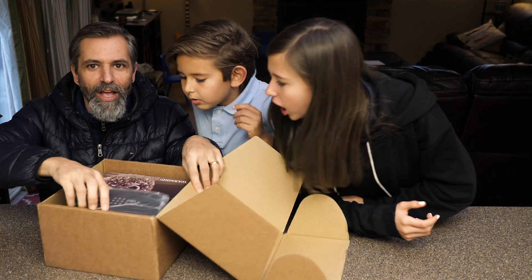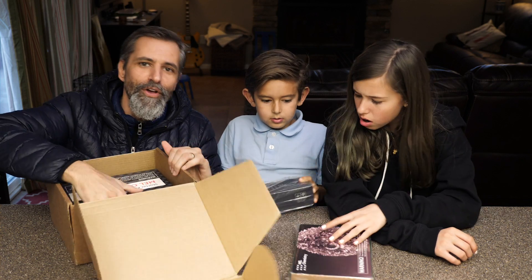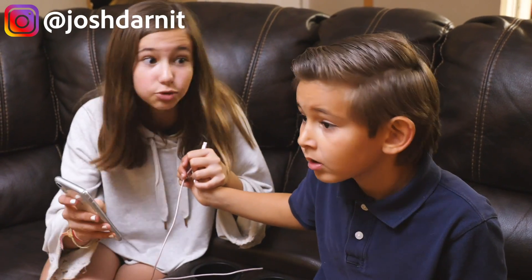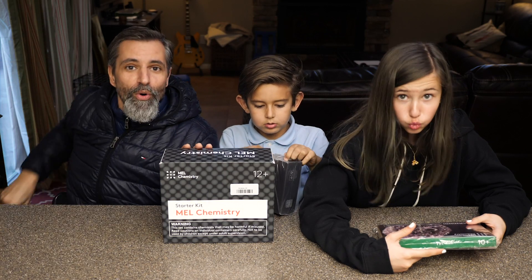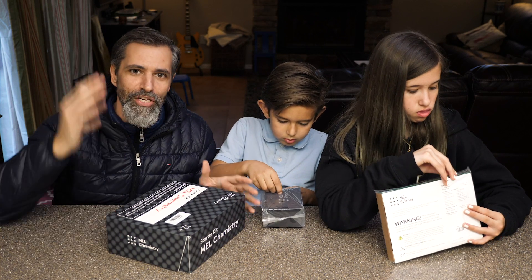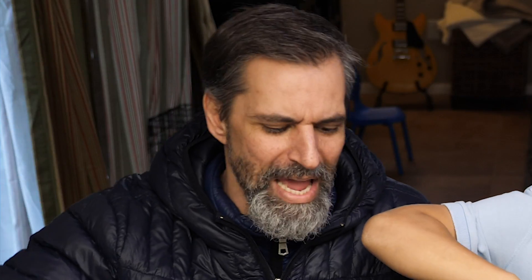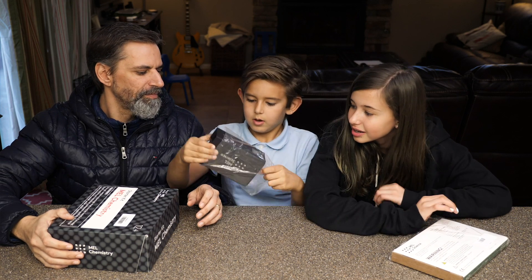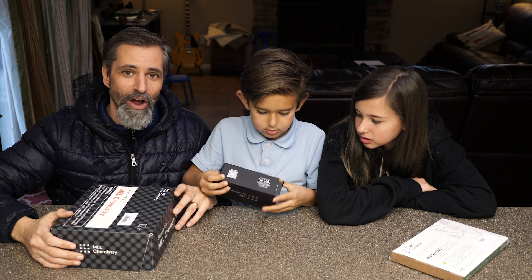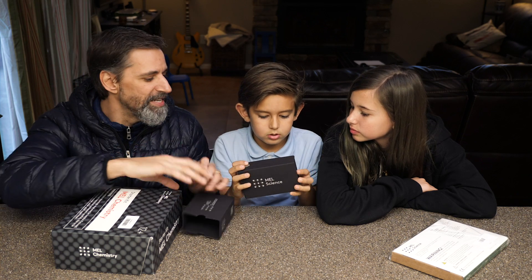Mel Science. Mel Chemistry. First thing right here — Evan, what is that? I don't know. I think this is the Mel Chemistry VR box, right? So cool. So you put your smartphone in here and it does VR chemistry stuff. We have not really done a deep dive into that yet, but we'll come back to that.